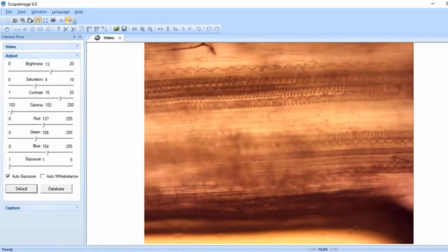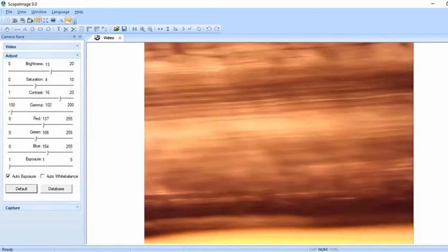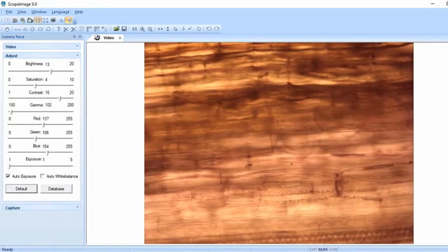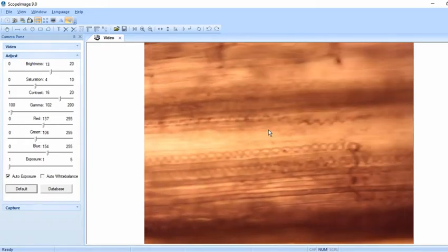From what I've been observing, fluid moves through them, through the center of them. So it's the vascular tissue. This is all just the cells all grouped up, and then you have these channels next to them where fluid travels through, and they're spirally. I love that. That is just really interesting. I wasn't really expecting this.